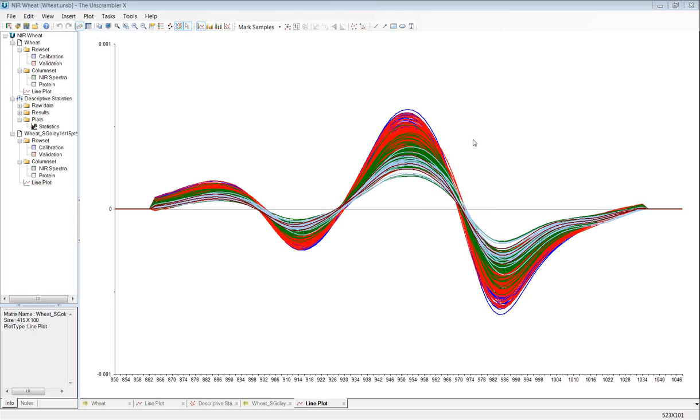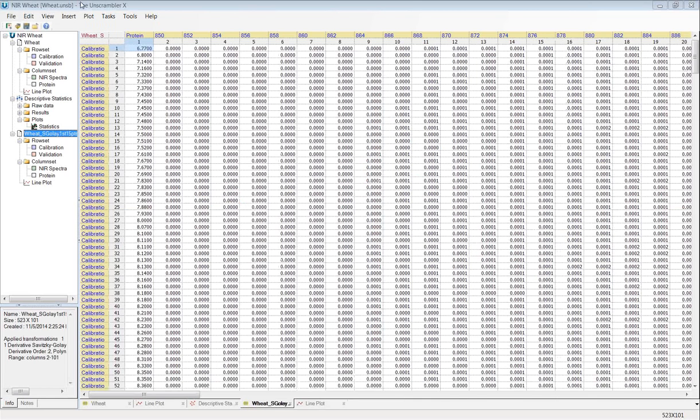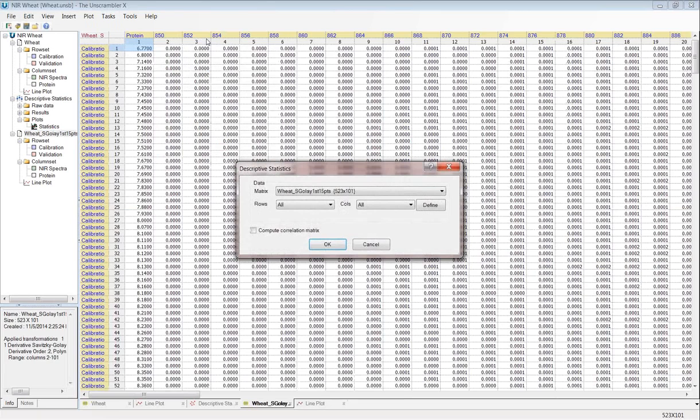So we can see there's a little bit of a trend, right? Blue is your lowest amount, red's your next highest, green's in the middle, and then these are the highest. But there's still a good bit of overlap of those data here. So again, I'm going to do my tasks, analyze, look at the descriptive statistics, see if there's anything I might have missed.